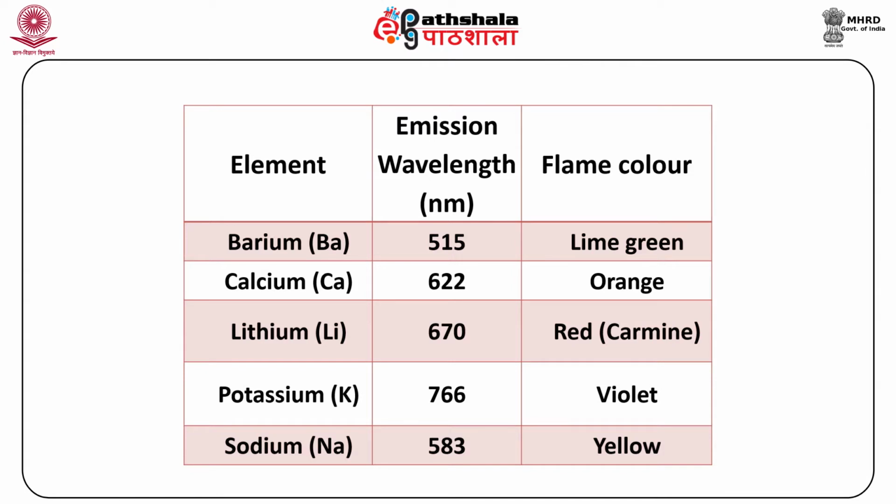Simple filters are used in a flame photometer as its analysis is done for simple alkali metals like sodium, calcium, magnesium, potassium and lithium. A filter is used for each element. For analyzing an element, its specific filter is used. It will filter out all other non-specific wavelengths.